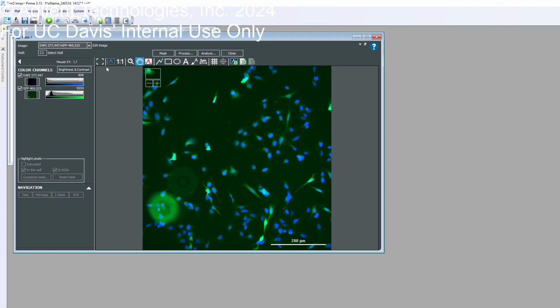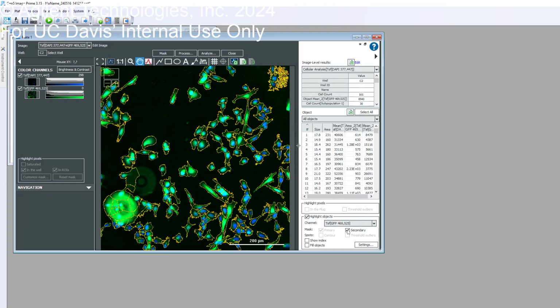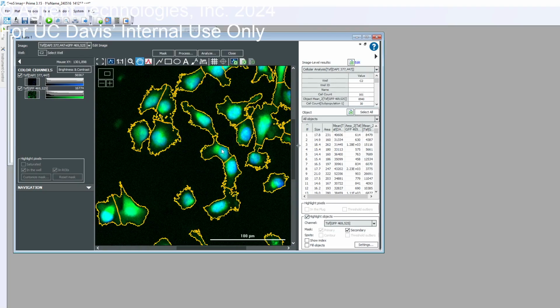If you wanted to use those, you can click on the top portion, left to that, DAPI plus GFP like this. And TSF stands for transform. Those are the processed images, and you can see it's doing a pretty good job segmenting the nuclei. You can see this is the background, so you can now go to the secondary mask, GFP. Click on DAPI and then click on GFP, and click on secondary. Now we are calculating the secondary mask, including this artifact, because it's kind of part of that artifact. But you can see the segmentation working quite nicely. It's going to be off in some cases, but for the most part it works.